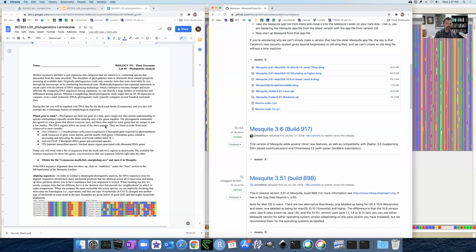So that was aligning. I mentioned the manual alignment tool here, and then also the automated alignment tool. And we've got a pretty good alignment there. So it says, make sure your sequences are aligned to your satisfaction before proceeding. And I say, sounds great. All right, now we're going to use this information to build a tree.